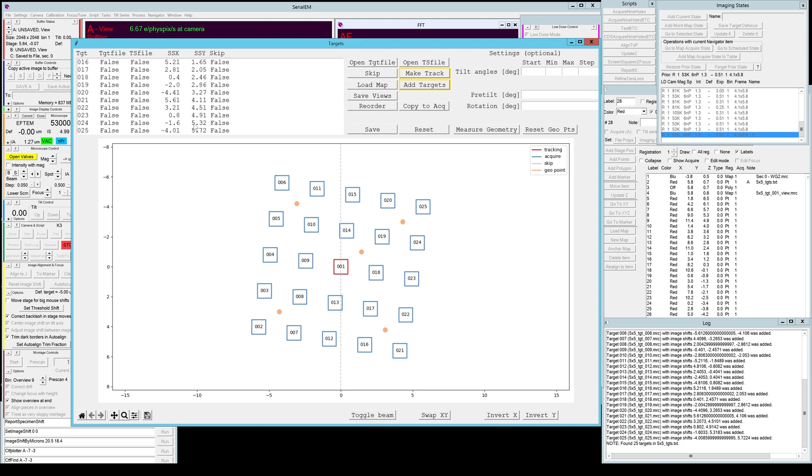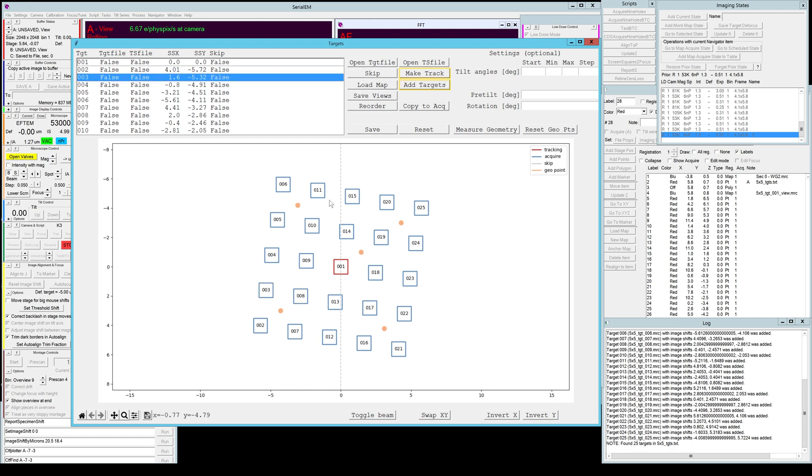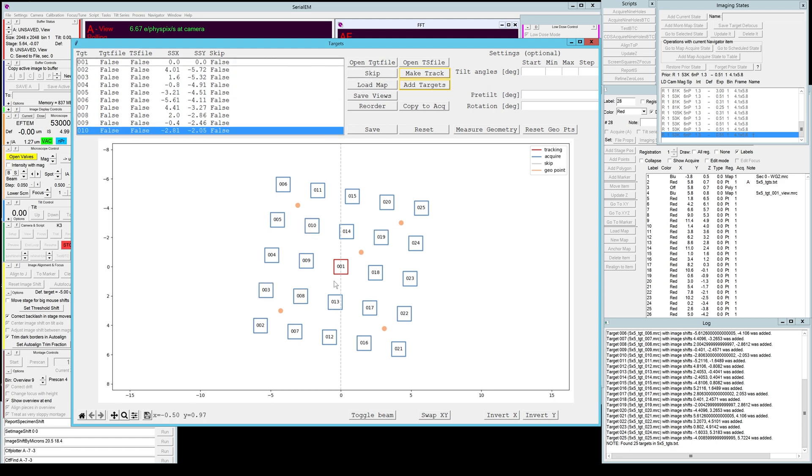If you want to skip a certain target, let's say because a hole was broken for example, you could skip these targets either by selecting it and hit skip here or by just right-clicking in the plot. In the plot you can see the orientation of the whole pattern to the tilt axis.